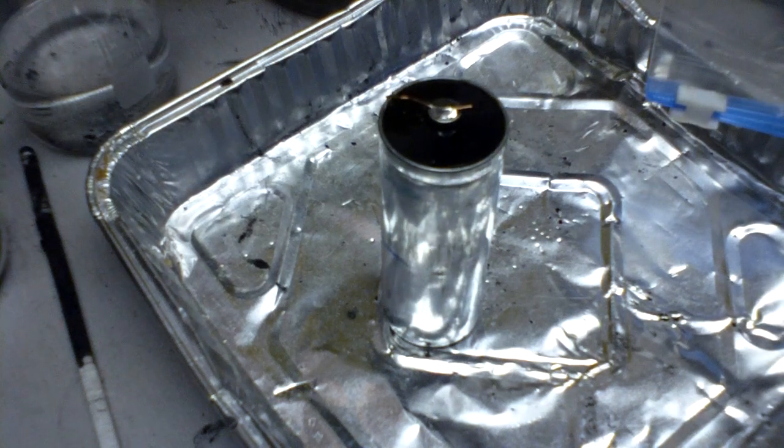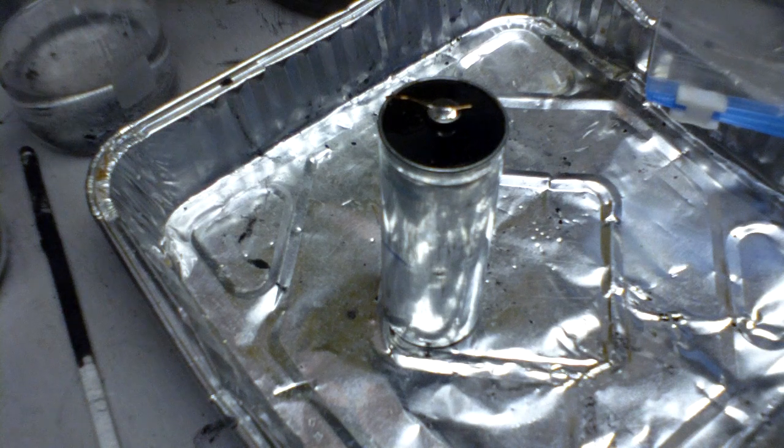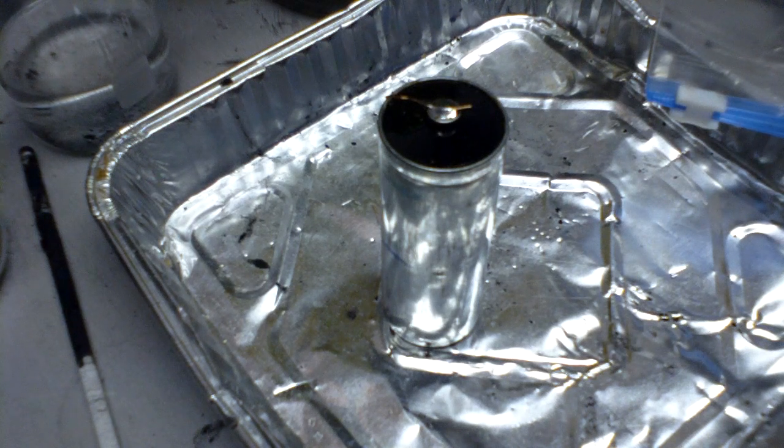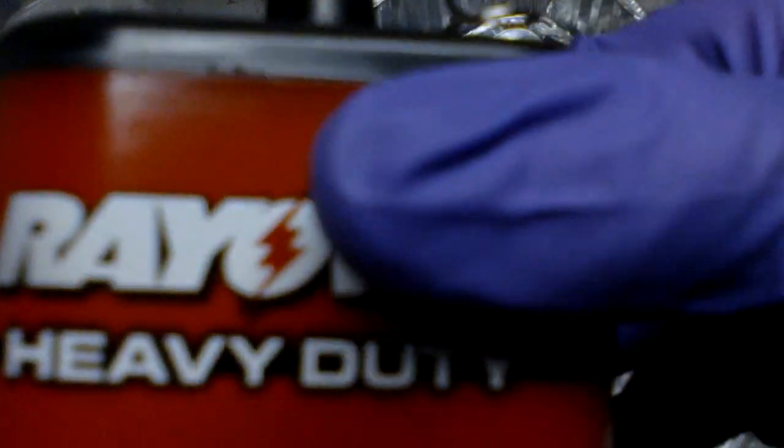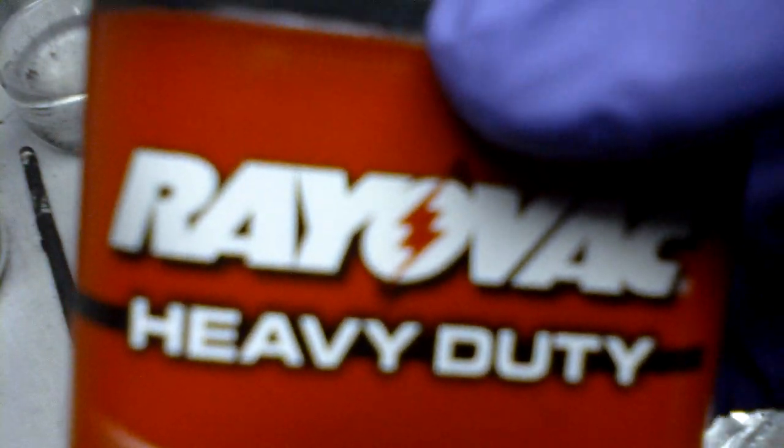The first step is to acquire a 6 volt lantern battery, and not all batteries are the right type for this. The battery should say on it heavy duty, super heavy duty, or something along those lines.